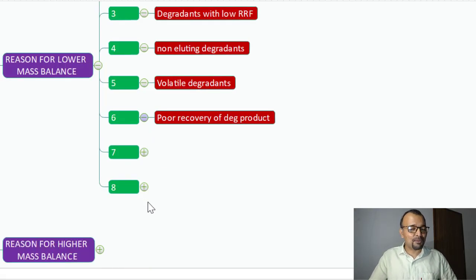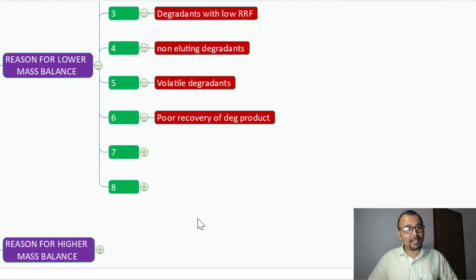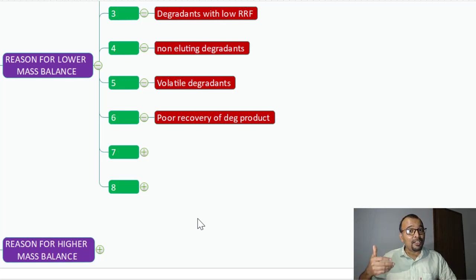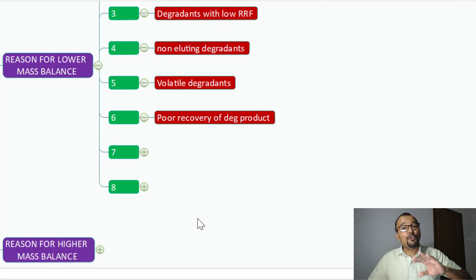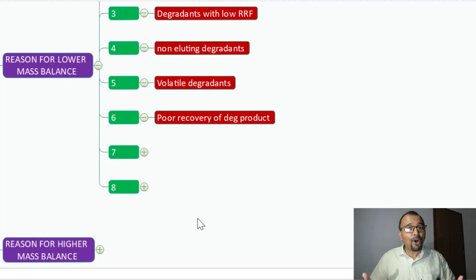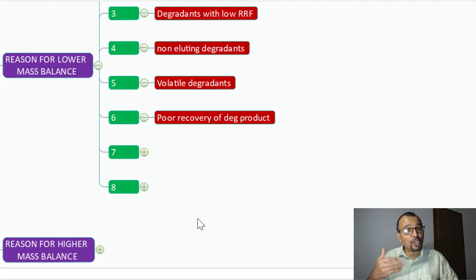Poor recovery of degradation products. In case you have a very complex sample matrix and degradants are generated but have a strong affinity towards the undissolved sample matrix, these degradants get absorbed onto the surface of the sample matrix and are not available in the actual sample solution. If you filter or centrifuge the sample solution, you are separating your degradants along with the solidified sample mass and losing all that degradant mass during quantification.